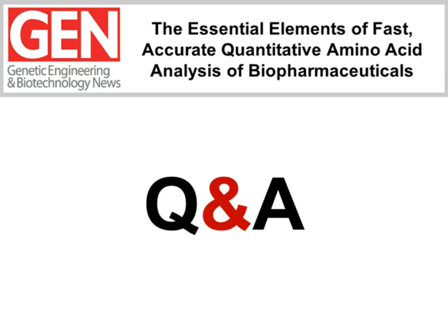However, as I discussed in the seminar, if the sample of protein is in a formulation where there's a great deal of non-protein material, then I would go to the liquid phase hydrolysis in order to get complete dispersal of the sample and complete acidification of the sample.